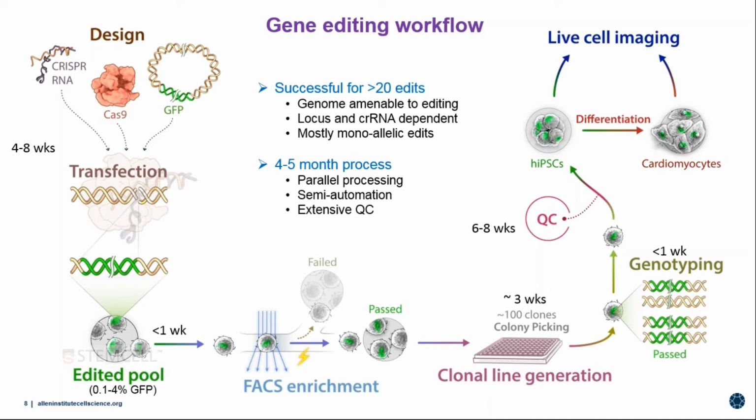This is really important to us because we are making these cell lines available to the community. So this is a resource we are providing, as well as making sure the images we generate and the models we create are coming from highly QC'd cell lines. And the way we are doing this, because we don't have a big group, is a lot of parallel processing using some machines, some automation, as I will tell you in a second.